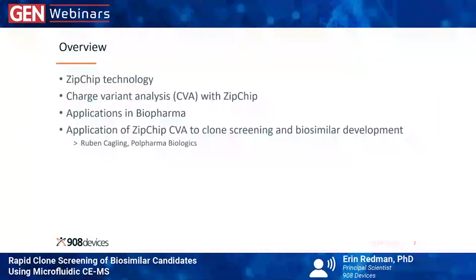Hi, thank you for that introduction. So in my portion of the webinar, I'm going to start off with covering a bit about the ZipChip technology. I'll introduce our charge variant analysis assay, cover a few key applications in biopharma, and then I'll pass it on to Ruben to talk about how he uses ZipChip in our charge variant assay for clone screening and biosimilar development.